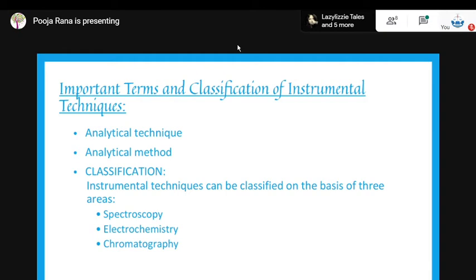The analysis result is presented in graph form, and you can visualize it by the different bands of colors which are produced after subjecting it to the instrumental analysis. All right, now talking about the spectroscopic techniques.